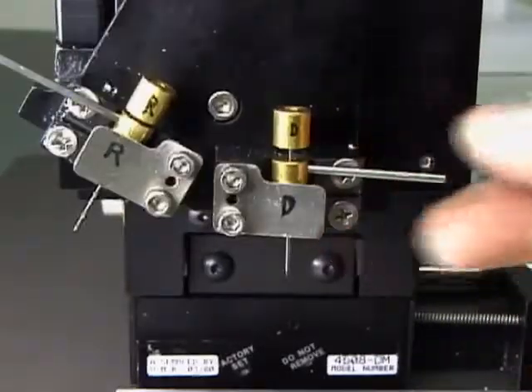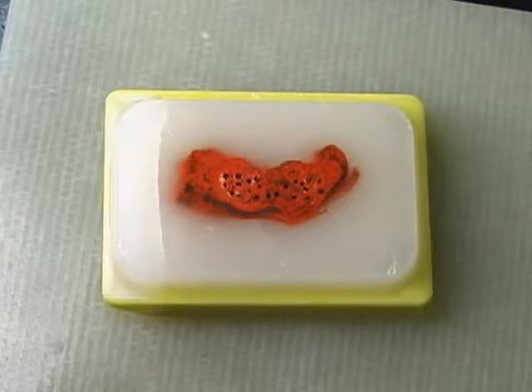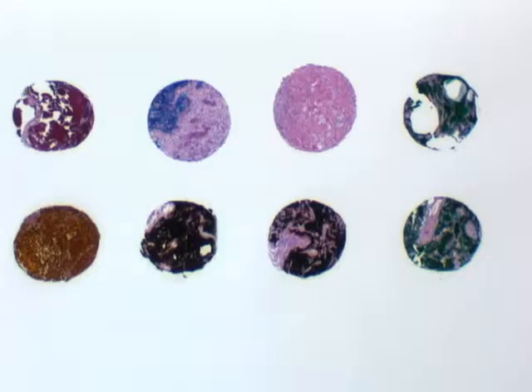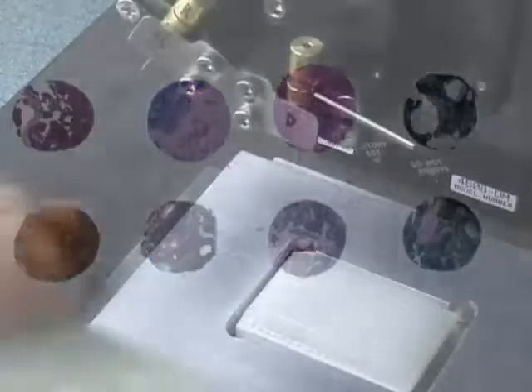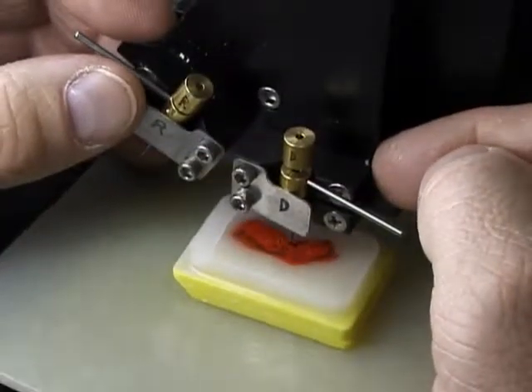Now switch the turret to the larger needle to punch the donor tissues. I am using a location marker to start. This helps the slide reader to maneuver around the array slide without confusion. There are numerous tissue dyes on the market. Lung is the best to dye because of its sponge-like characteristic.